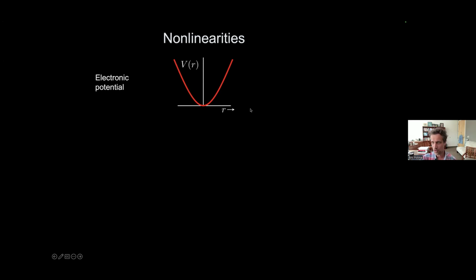They move at the optical frequency of the light, of course. These electrons are bound to their molecule. They don't fly off, and they are bound by a harmonic potential. That's indicated by this guy right here. And the nice thing about this harmonic potential is that if you plot the polarization that you create because of the shaking of that electron, moving the electron away from its equilibrium position, the polarization scales linearly with the incoming electric field strength.